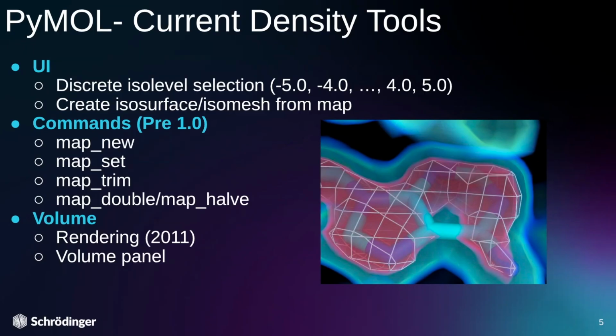One of our newer contributions to the EM space is volume rendering. It's not that recent, but it's recent relative to PyMOL features. Volume rendering was introduced back in 2011 by our previous tech lead, Thomas Holder, another very prolific PyMOL user.